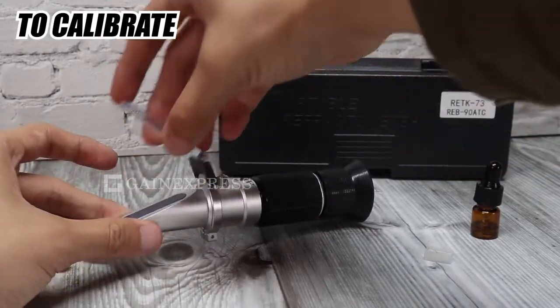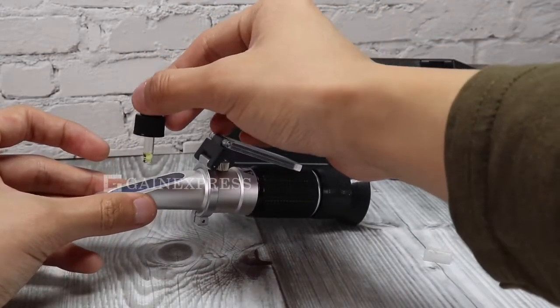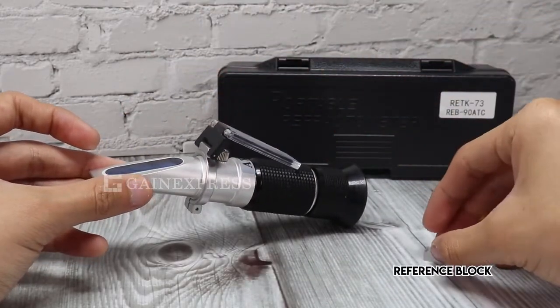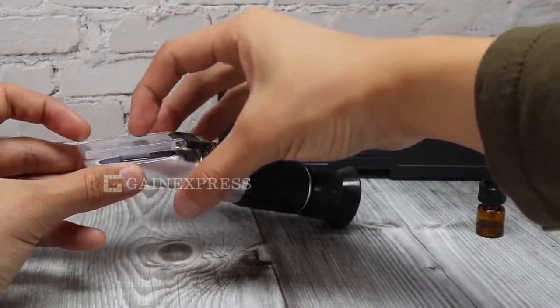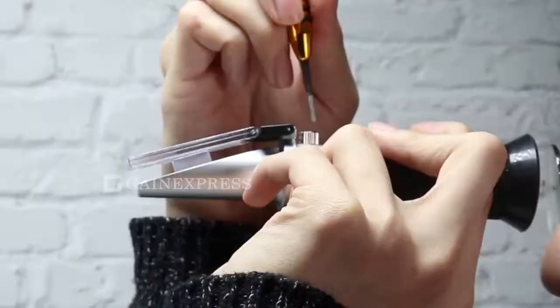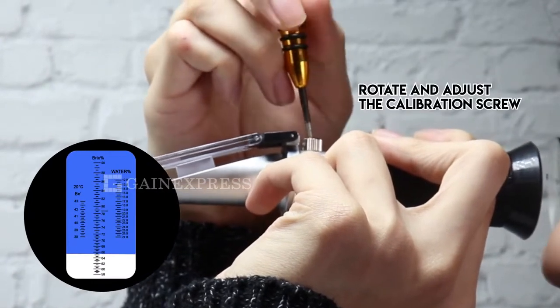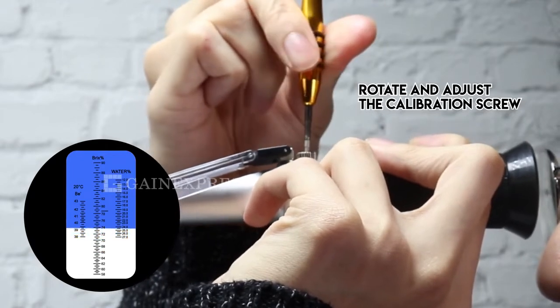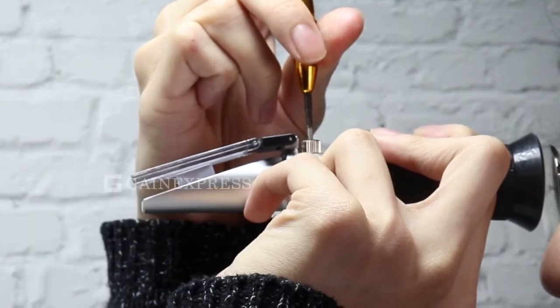To calibrate, open the daylight plate. Place a drop of dioptric oil on the surface of the prism. Stick the reference block on it, close and press it lightly. Face the prism in the light and look into the eyepiece to check the reading. Then rotate and adjust the calibration screw to make the light and blue boundary coincide with the reference line at Brix 78.8%. The calibration process is now done.